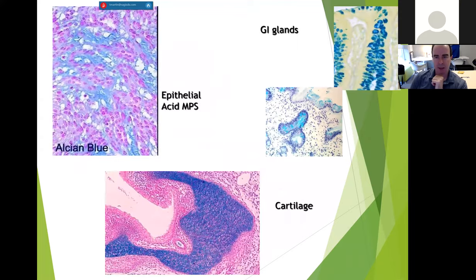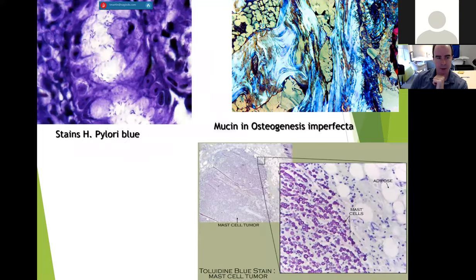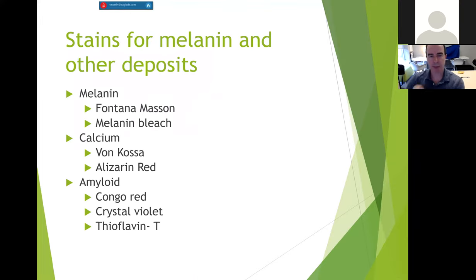Okay, we've talked about these. We are going to skip past these. So let's go on to staining for melanin and other deposits.